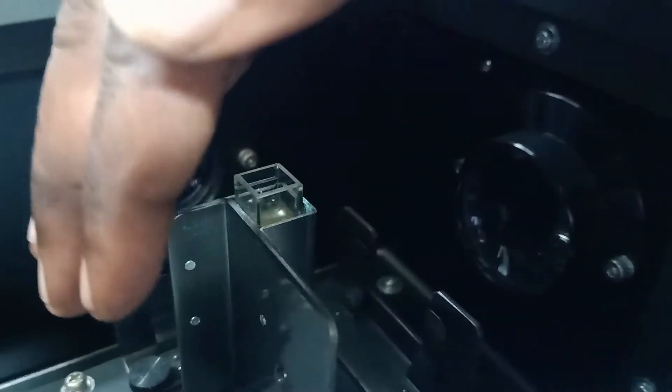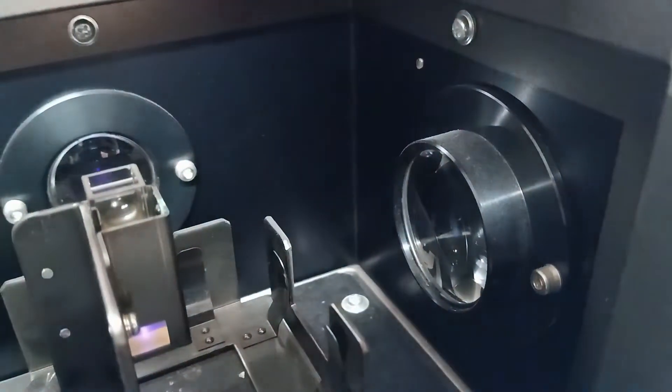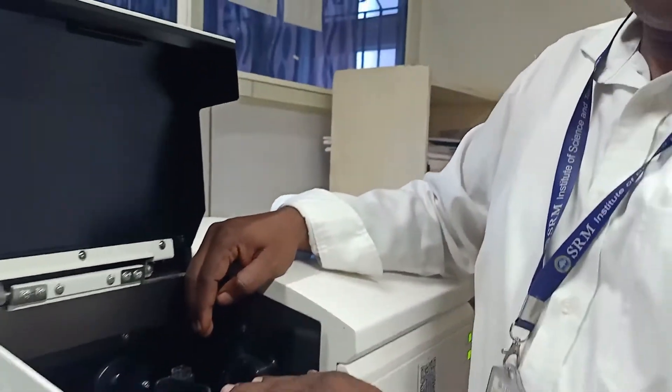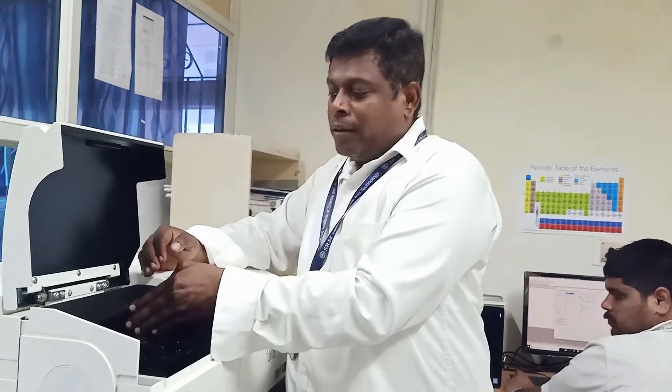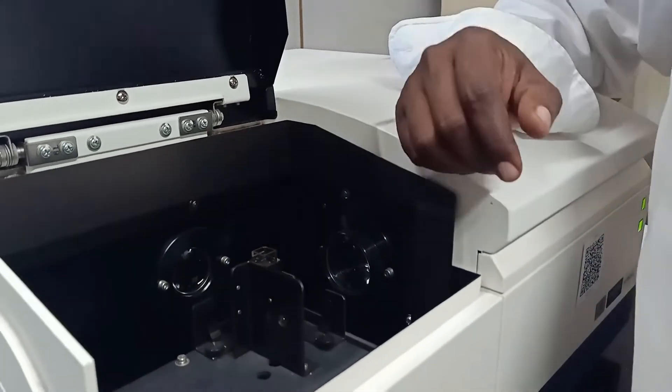That blue light shows that there is a particular wavelength of light hitting the bottom of the cuvette. When the light passes through the sample, the molecules will get excited, and if it contains a fluorophore, it will emit a fluorescent light. That would be detected by the second detector, which is at 90 degrees to the light path.